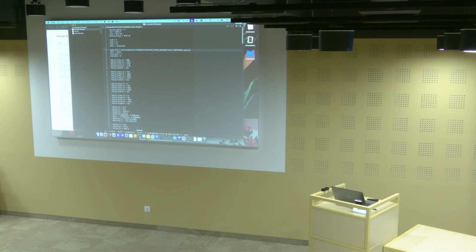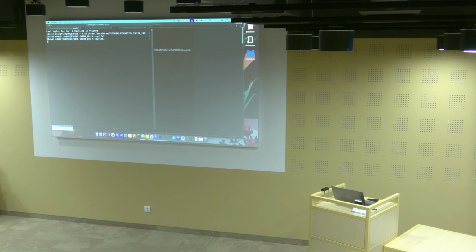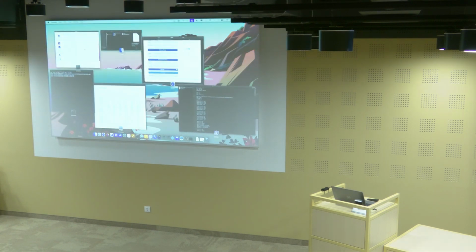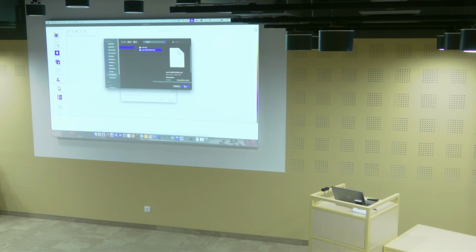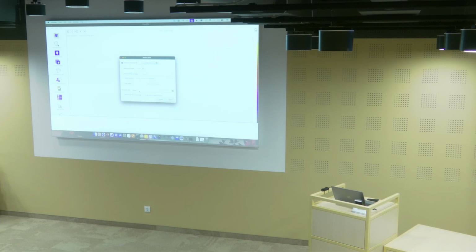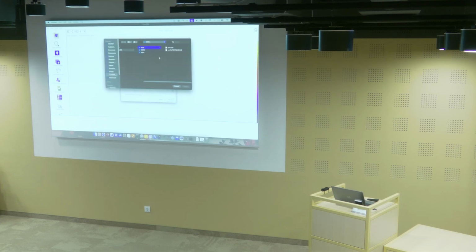So we're going to start crystallography. Already tried it before. Yep, so here is the window opening. And so we can load the data. So press load data. There are different ways to load your data. You can have an input file, or you can have a file list which contains all the locations of your input files. But since we're just going to look at one input file with multiple images, we can select an individual input file. So that's this one. And indeed, it also asks for a geometry file, so we can find it over here.